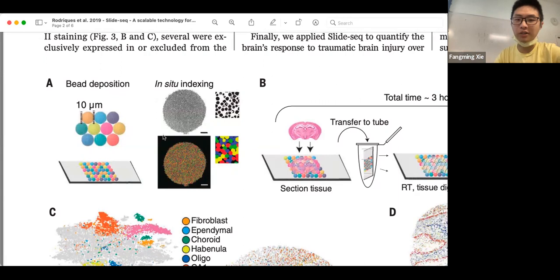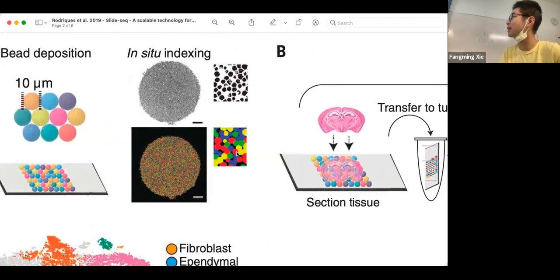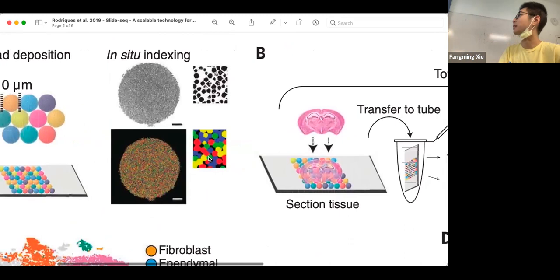They actually do that with imaging. For one round of imaging, you can resolve one letter in your DNA sequence. We know DNA has four different possible letters, A, T, G, C. That's why you see four different colors if you actually count. So each round you get A, T, G, or C, but you have many rounds. It's a barcode again, a unique barcode for each bead. Then you save this. Now you have a lookup table between the uniquely barcoded beads and their spatial location.